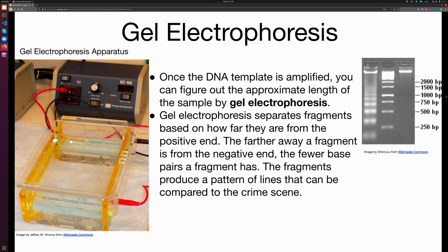So 1,500 base pairs, you just change it. Maybe you get something that's far away from 1,500 base pairs, so you can see it's somewhere between 1,499 base pairs and 251 base pairs. And maybe there's a 1,000 base pair mark, and it doesn't quite hit that, and it isn't even close. So you can say it's somewhere between 251 and 999 base pairs.